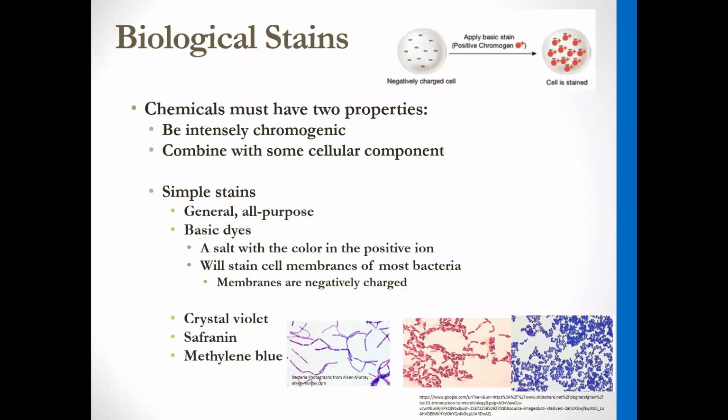So if you look at these pictures, notice that you get this white colorless background and very colorful cells, okay? That is the hallmark of simple staining, a whitish background and stained colorful cells. Now, depending on how well the staining was done, kind of like in that middle picture, there's sometimes a color associated with the background, but if you wash your cells and do your staining completely properly, you shouldn't have any residual color in the background. It should always be the white background and colorful cells. Okay, so let's talk about how we actually go about preparing a sample and then staining it.